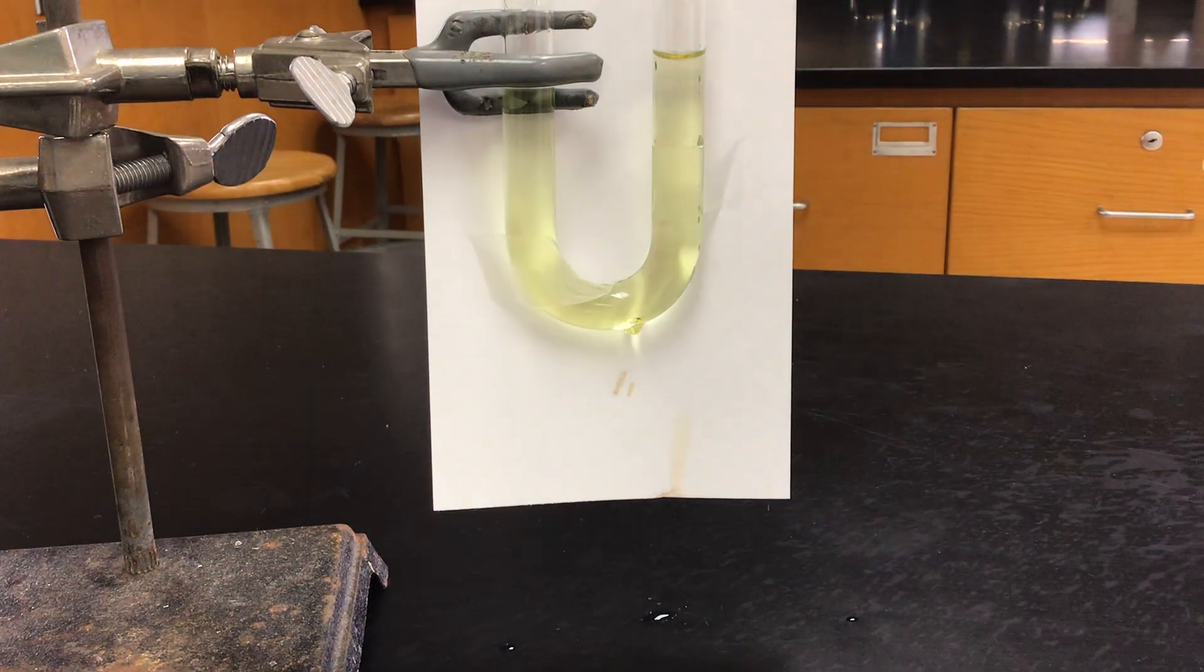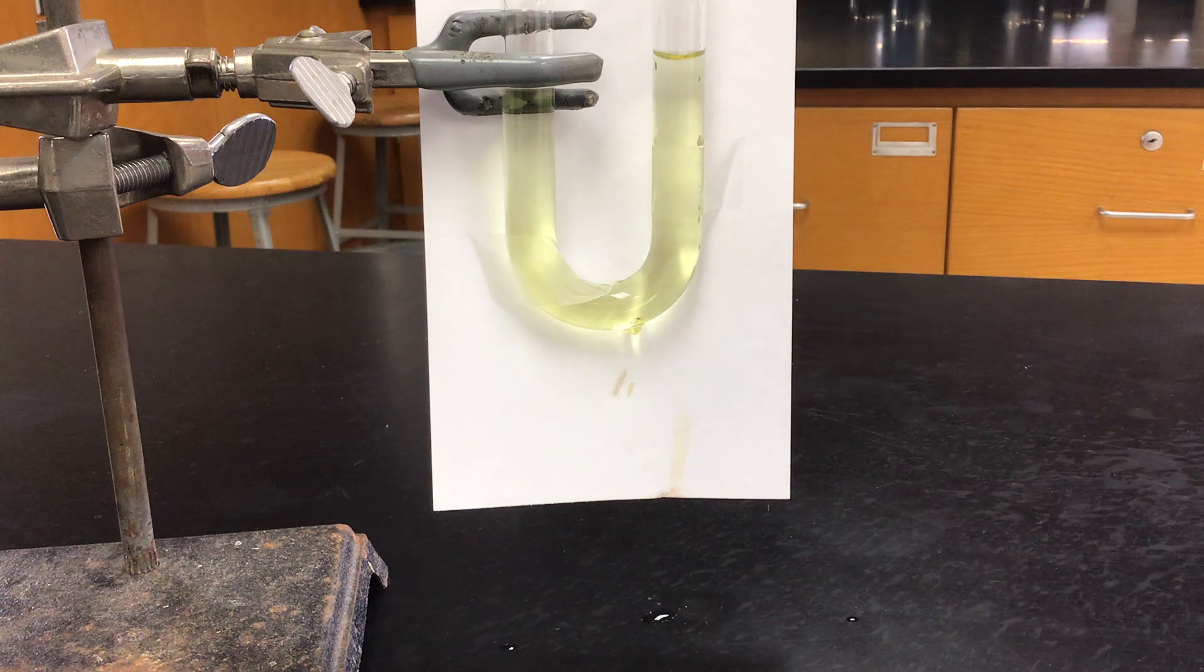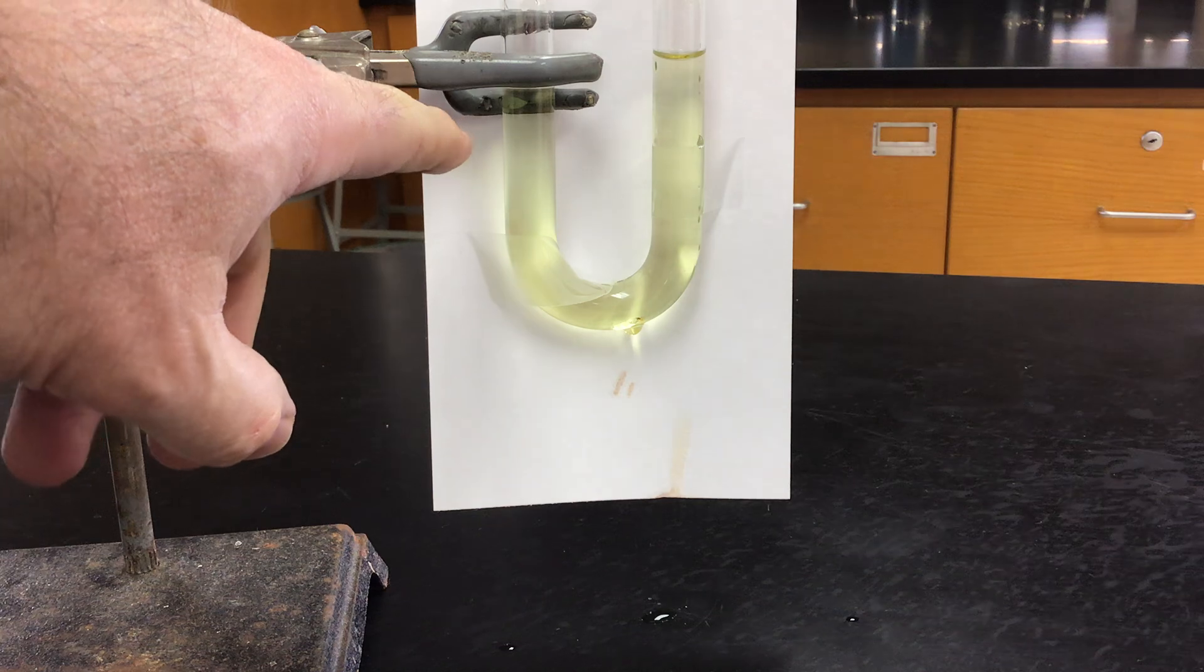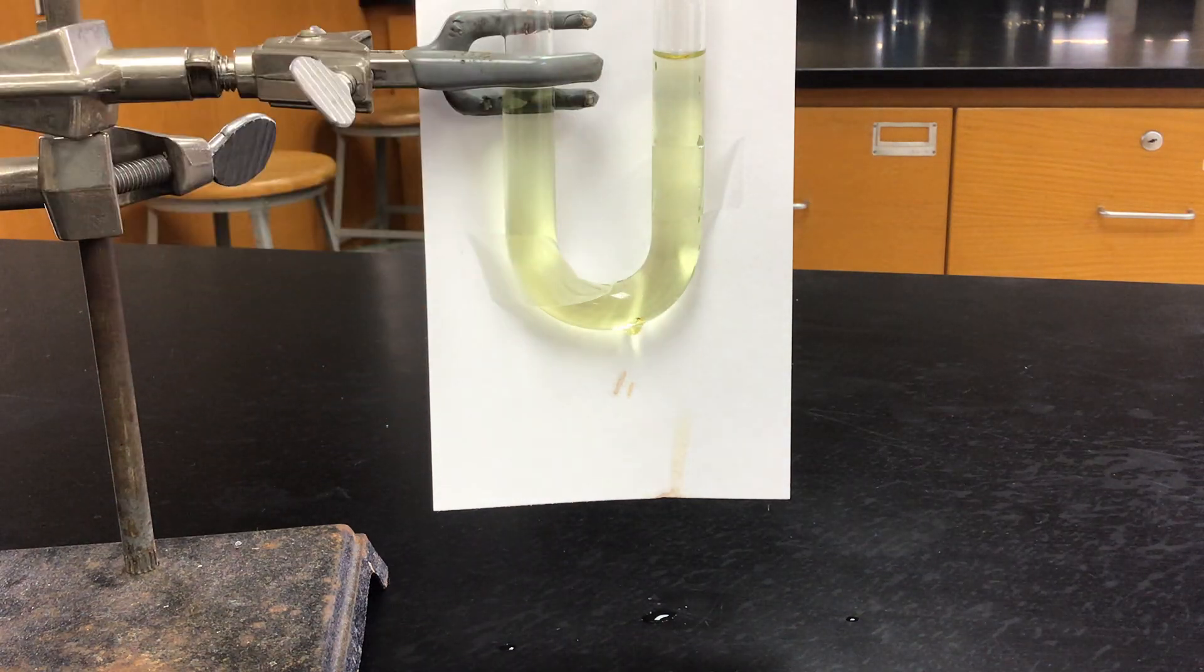I'm going to take these out and drop in some universal indicator. Now, I had the electrode set up in the same configuration, so I think iodine was forming on this side, left-hand side.